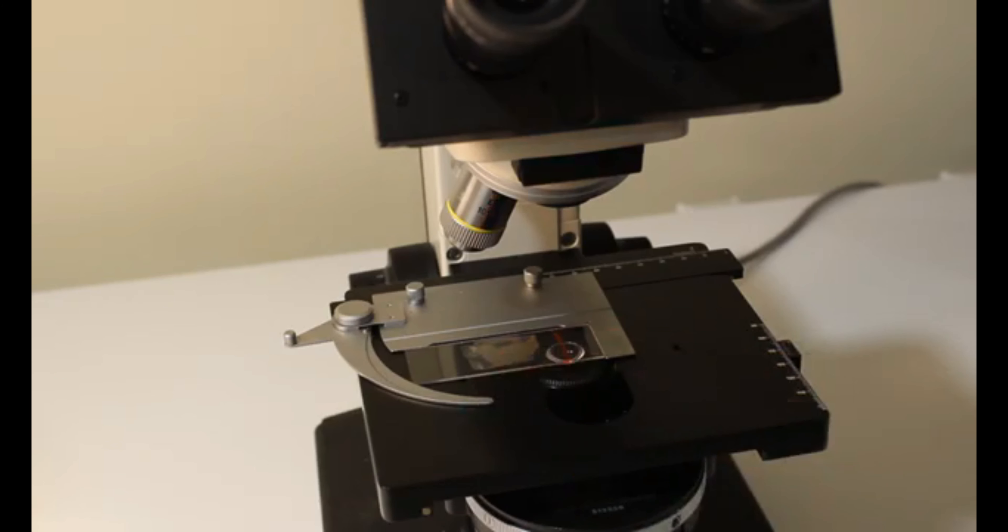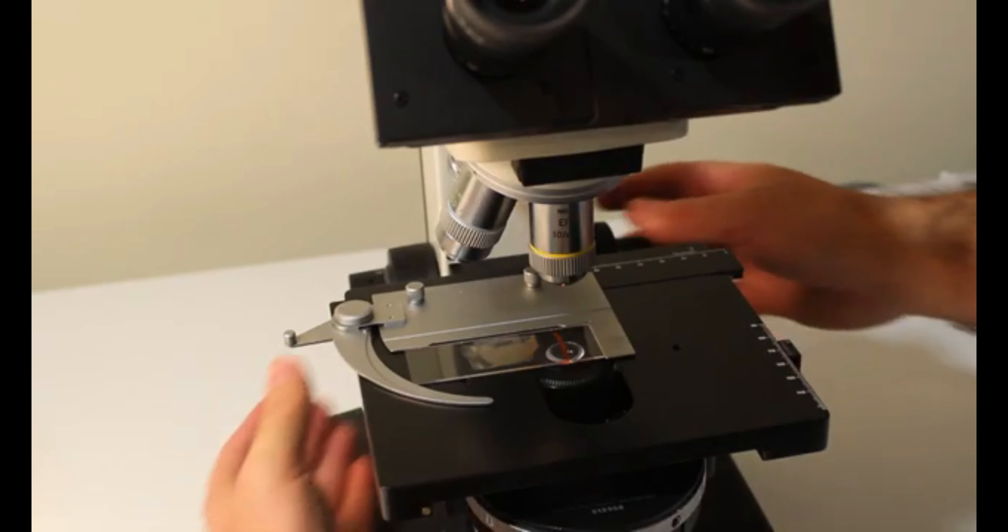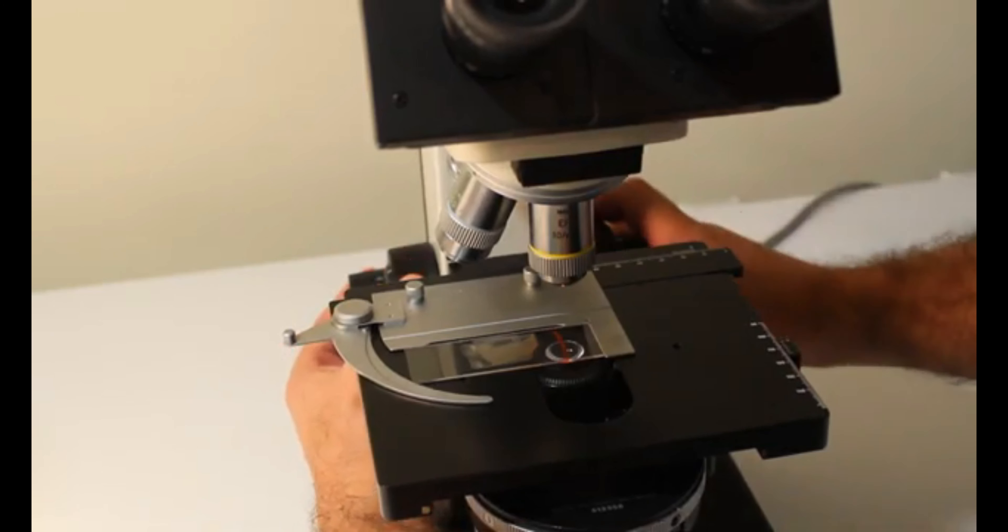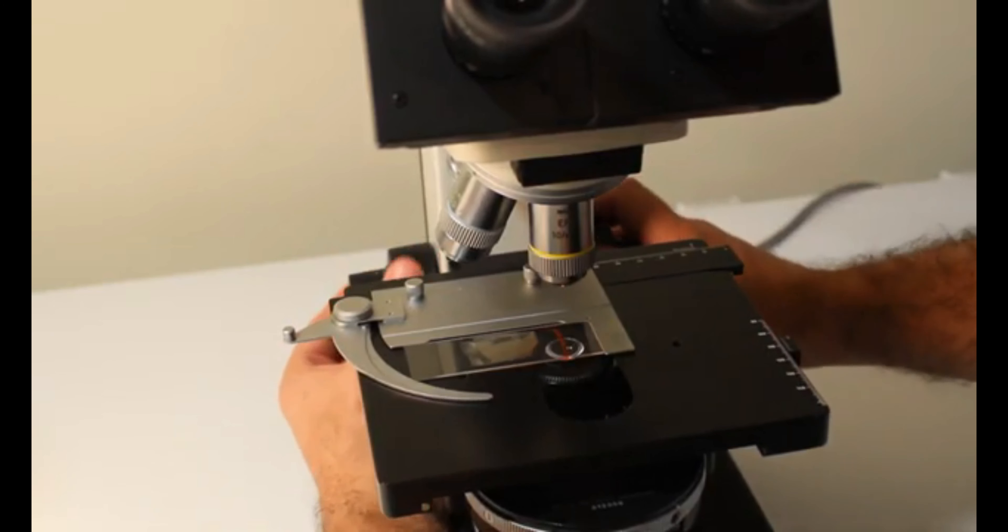What I want to do next is turn on my light source and swing into position my lowest magnification lens. You always want to be starting with your lowest magnification lens because this is the easiest lens to find your focus on. Now, while looking through the eyepieces and turning the focus knobs, I want to bring my sample up until focus. Basically looking through the eyepieces to see when that sample is actually in focus.